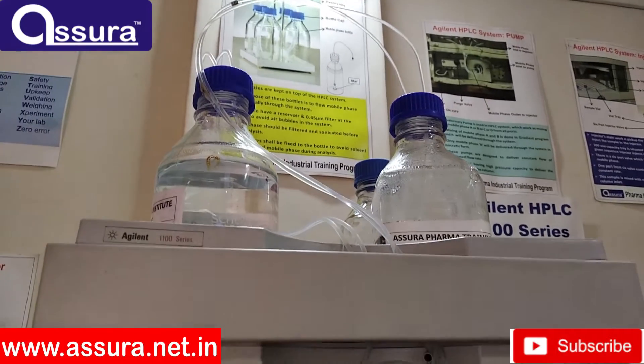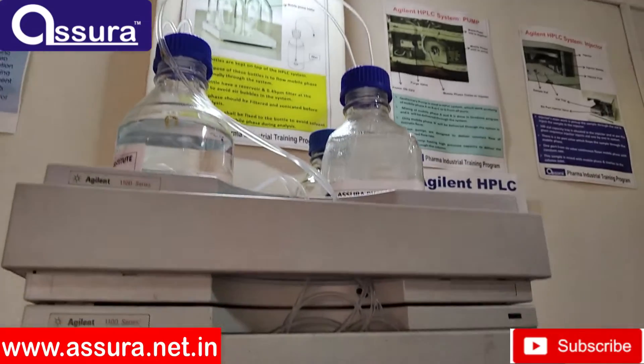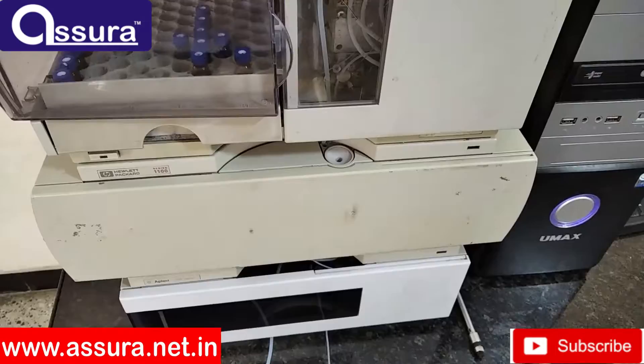Hello everyone, today we are going to see the most important instruments you are going to install. That is HPLC mobile phase bottle.